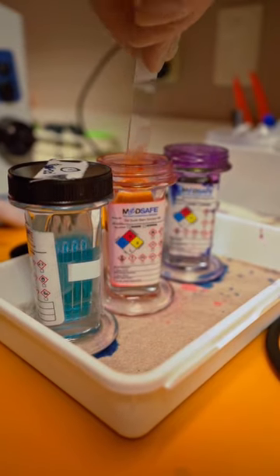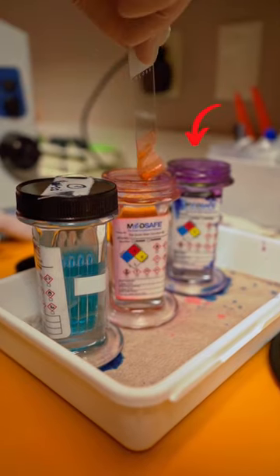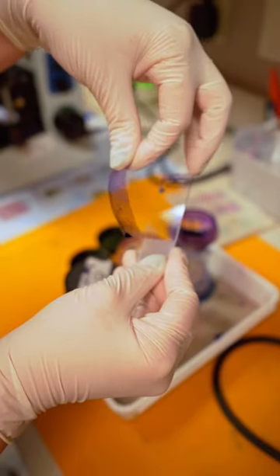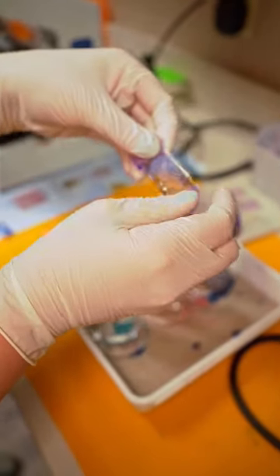Next, we will stain the slide by dipping the sample 10 to 12 times in the red stain. You will repeat the process in the dark blue stain as well. Once done staining, lie the piece of tape flat on the slide, being sure to wipe away any excess stain.